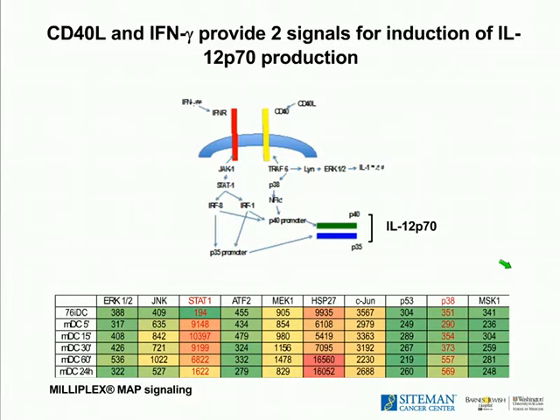So we took dendritic cells and activated them with interferon gamma and CD40 ligand, made lysates, and then we looked using the MILLIPLEX MAP signaling at the STAT1 and p38 kinases, their phosphorylation upon activation. And what you see here is where it says IDC, that's the baseline. When you activate, STAT1 is phosphorylated by 5 minutes, and it goes up, peaks at about 15, and then it comes down. Well, p38 is a little delayed, and it peaks at about 60 minutes, and then it remains up.